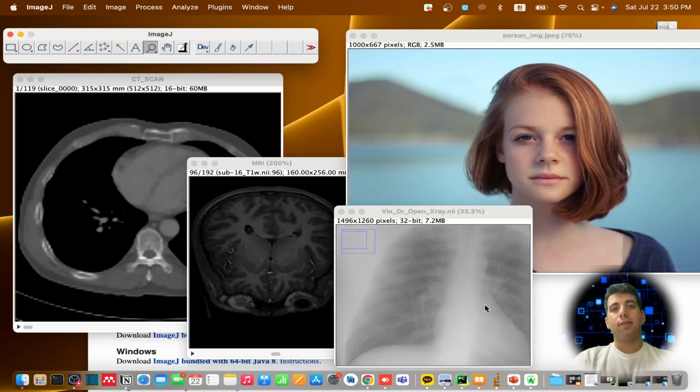This channel is more about computer vision, and the technology that is revolving around computer vision will be covered and reviewed in this channel. I'm delighted to introduce one of the simplest yet most powerful image analysis tools.